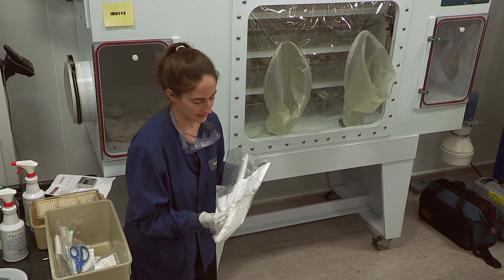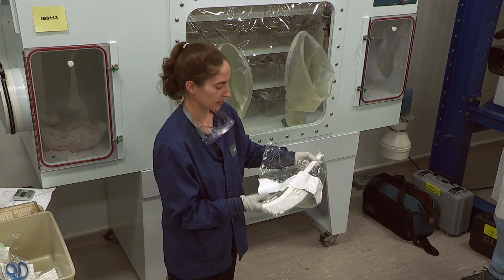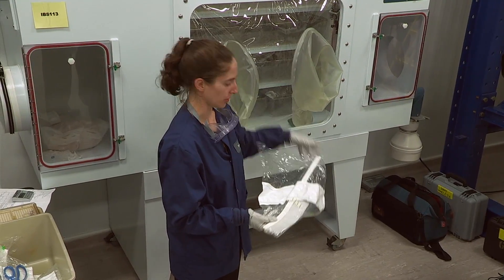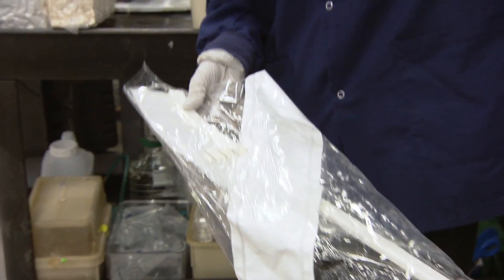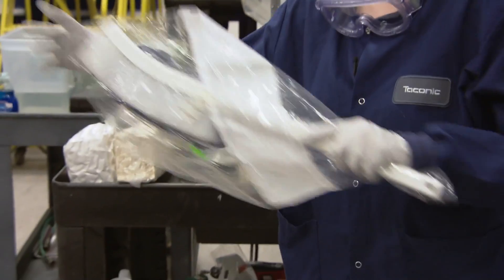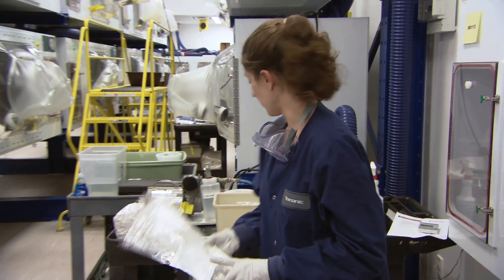One other thing we have is just a basic brush, almost like a brush you would use for your car. This is really helpful when you're cleaning the isolator to go through and dust off the individual shelves once the cages are removed. You could also wrap a paper towel soaked in sterilant around it to help reach the far corners to get out all the dust and food particles.